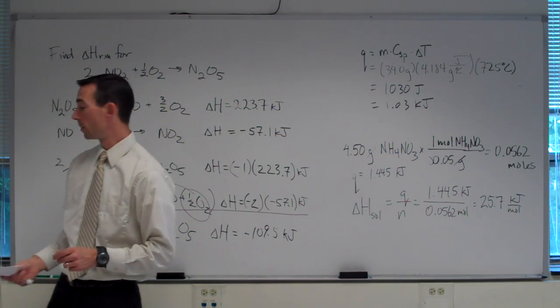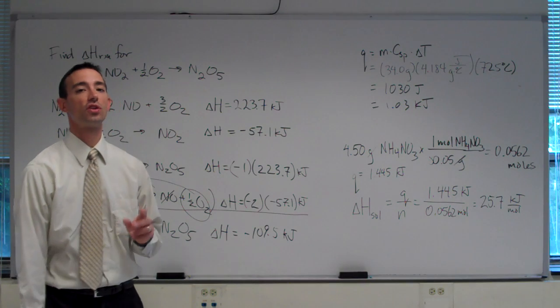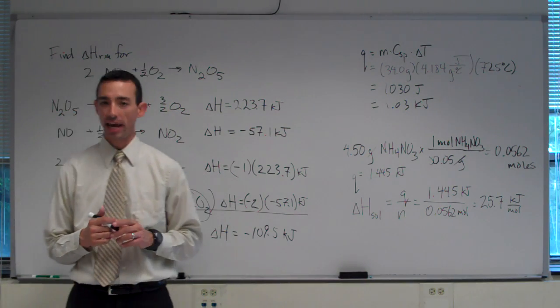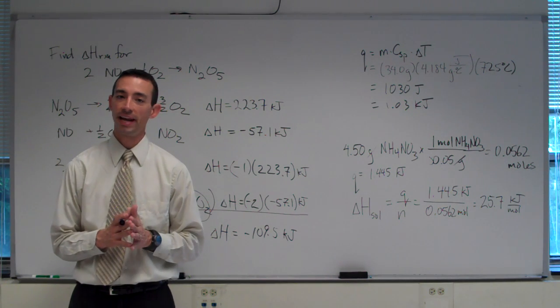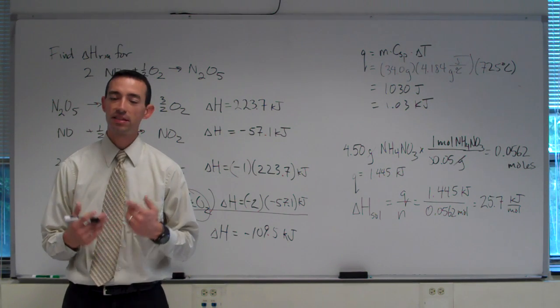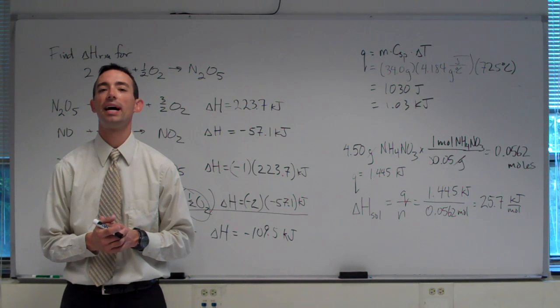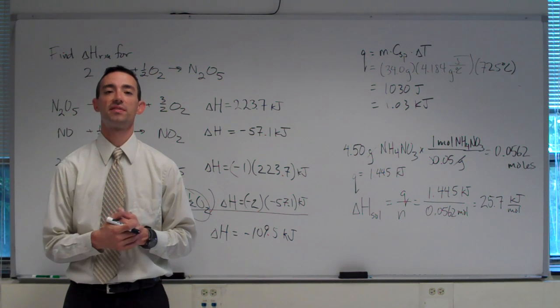You will be working with acid, and it's fairly concentrated so that we get rapid reaction in today's experiment. So take care when you're handling the acid. Avoid spilling it on your hands and on your clothing. You may want to wear a lab apron. Not really necessary as long as you're taking the appropriate precautions not to spill the acid. And you might want to wear gloves as well if you have sensitive skin.